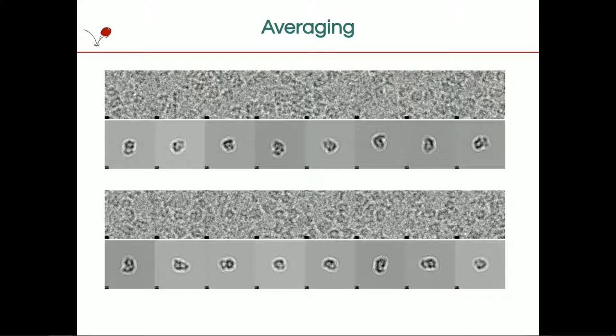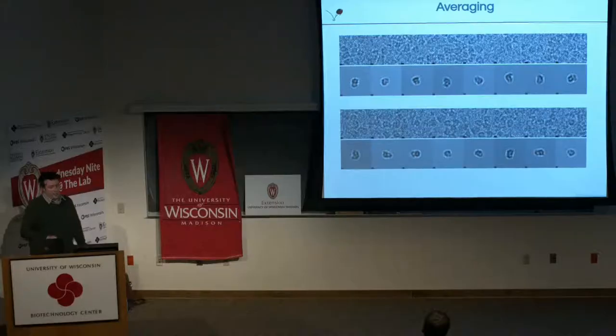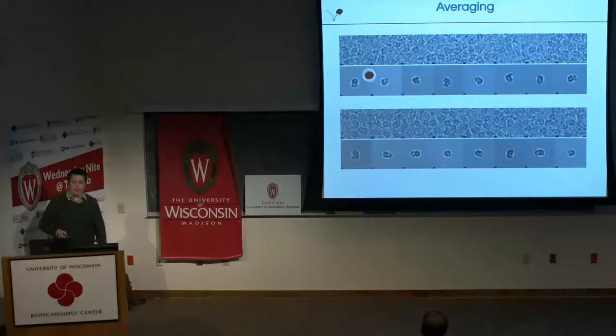That's actually a very involved process that I'm not going to go into in great detail. I'll give you the quick and dirty description of how that's done. And that is to take a model. You need some kind of model, and it can be largely wrong. It just has to be a little bit right. And then you can start looking at what that model would look like from many different directions. So this is called projecting. You project it in many different directions.